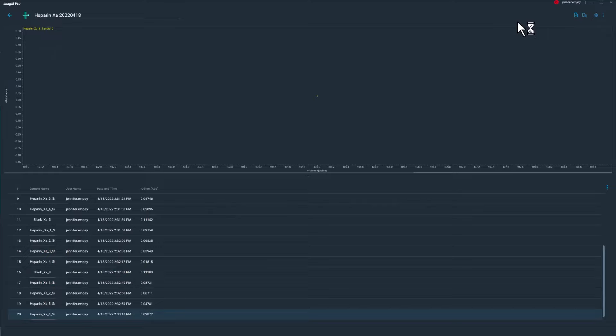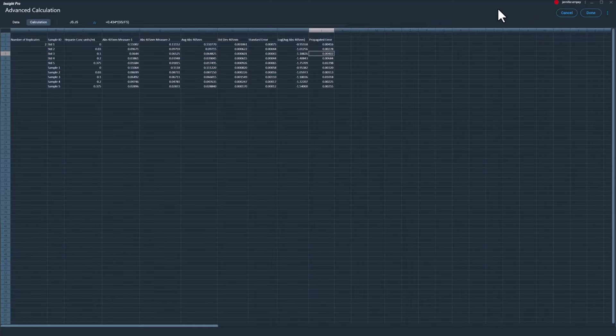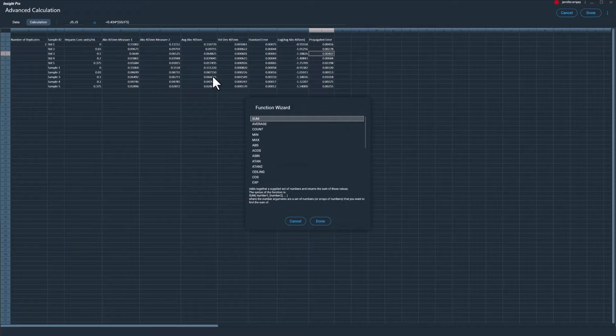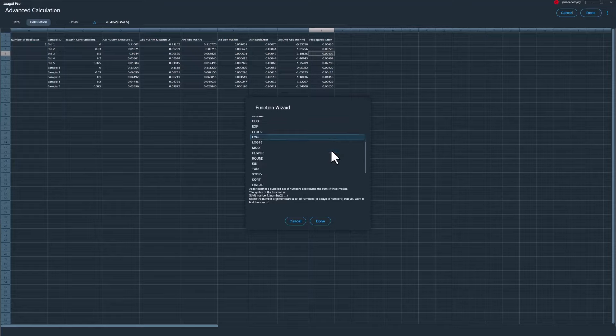For all available methods, the Advanced Calculations functionality can be used to further work up the collected data. Advanced Calculations features a spreadsheet format, enabling users to analyze data using more complex mathematical functions, including average, standard deviation, logarithmic, and trigonometric functions.